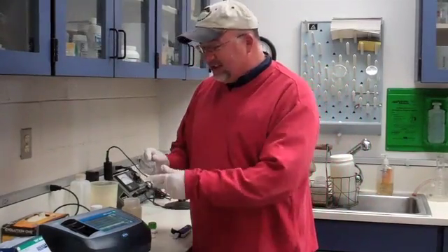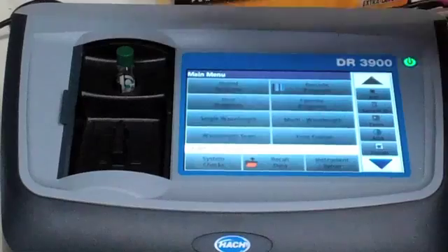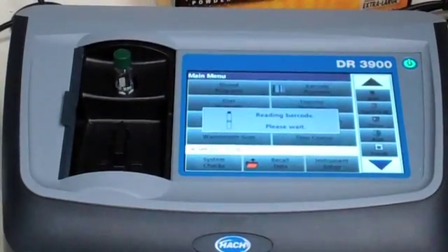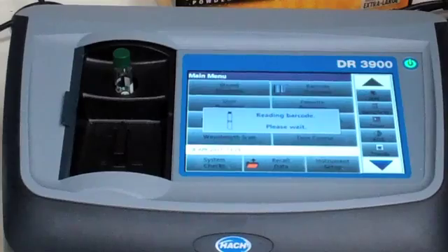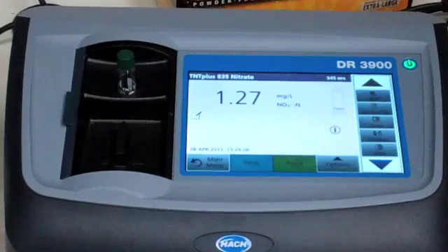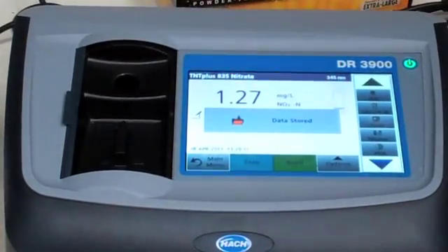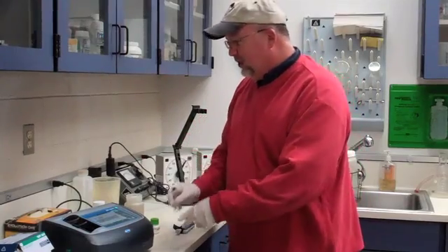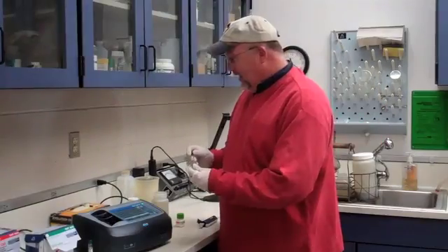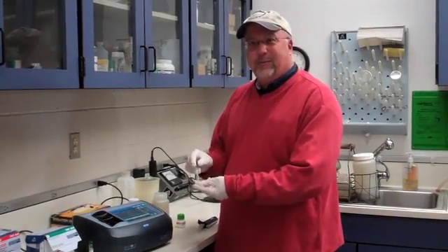Our 15 minutes is up for this test, so I'm going to put this in the machine, and it will do all the analysis from there and give us a reading. And we're done — I pull this out, and the result is stored in the machine. That's the whole test. It's easy and fun to use, and we just enjoyed using the equipment.